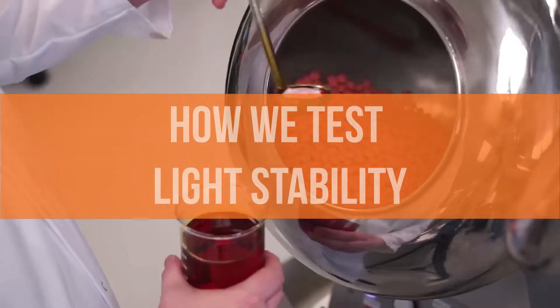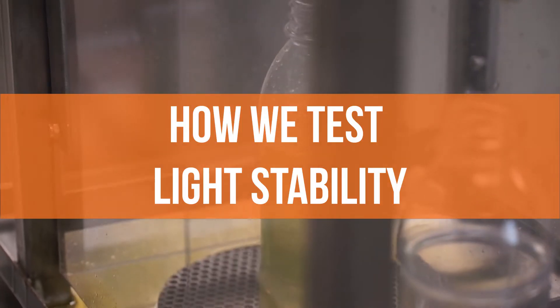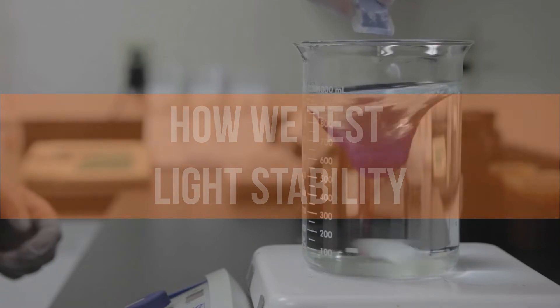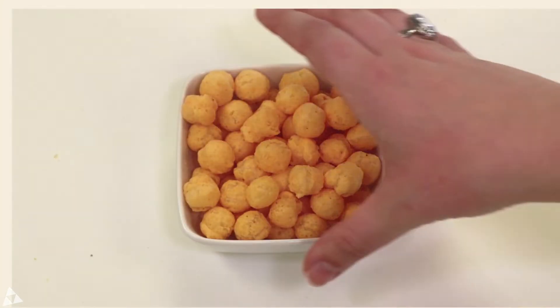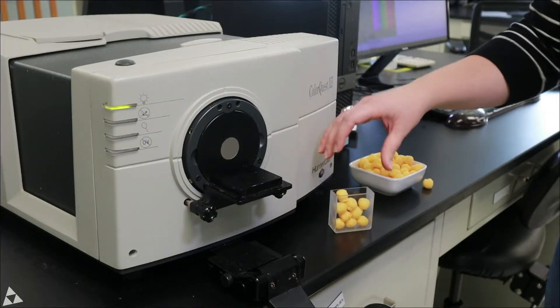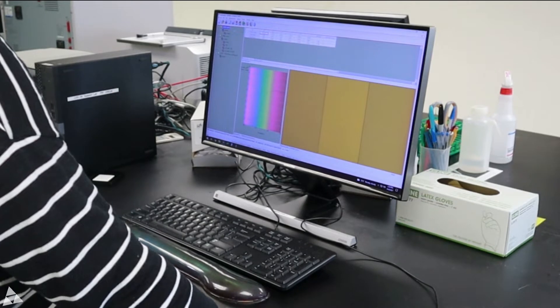It's critical that a color remains vibrant throughout a product's shelf life. That's why we test our colors to ensure they remain stable when exposed to light. Here's how we do it. In this example, we'll use annatto color in the seasoning for cheese puffs. We measure the hue using a colorimeter — this measurement will serve as our baseline.